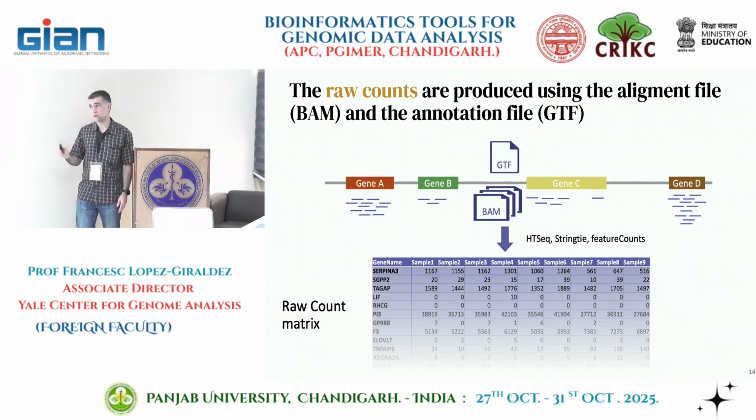Of course, we can talk about this, but you probably can assume you cannot do an analysis directly with the raw counts and compare samples, because each sample can have a different number of reads, right? So we need to normalize them, and we'll talk about this later.